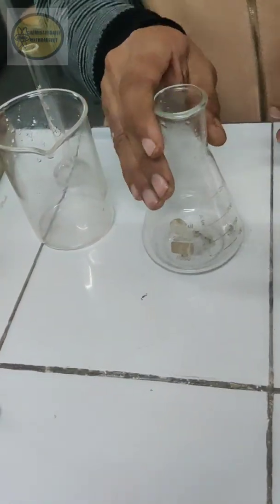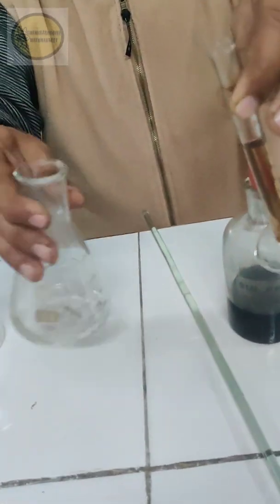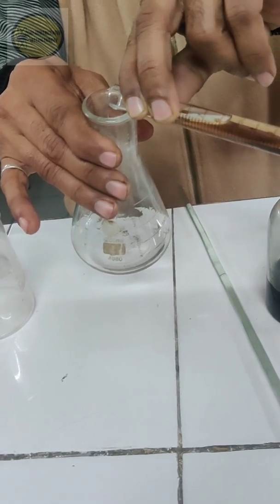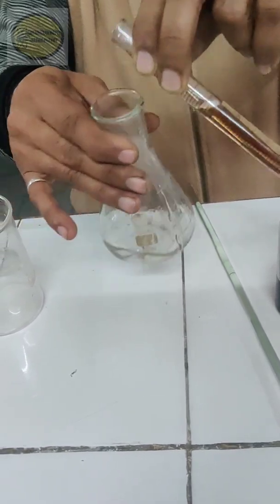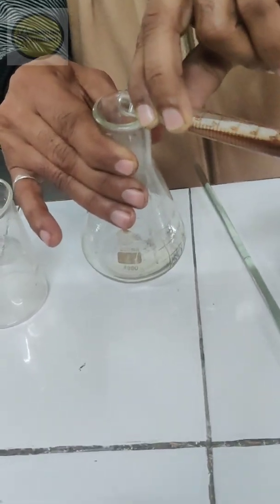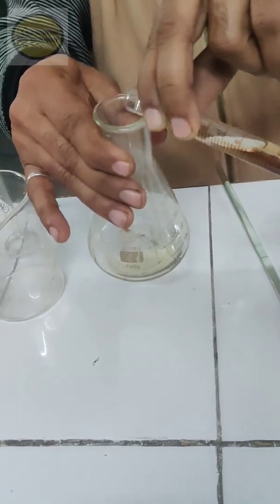Now what we are going to do is we will add about 7.5 ml of concentrated sulfuric acid in small installments to this solution with constant shaking. And this is a kind of exothermic reaction, so you will feel that the mixture becomes warm.